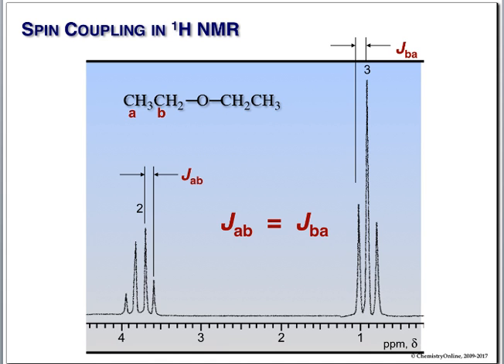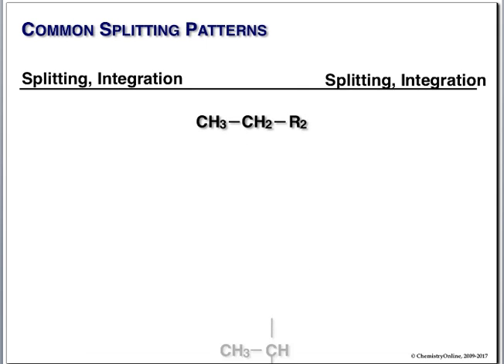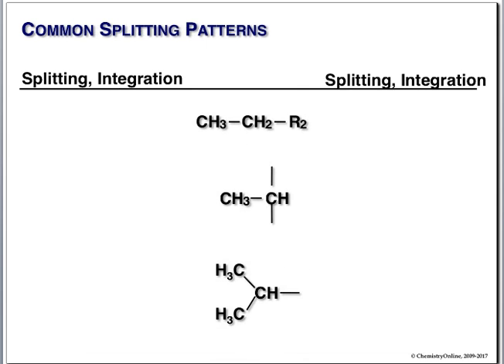So let's go through an assortment of common splitting patterns. Look at these. On this side, we're going to do hydrogens here. This side, we're going to do these that are next to it. Decide what our splitting pattern should be.